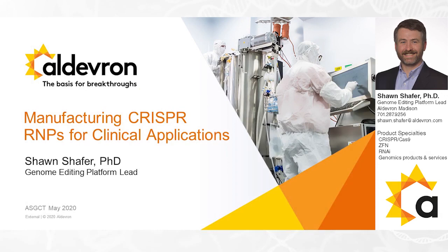I'm going to be speaking to you today about the work that we've done at Aldevron to manufacture CRISPR RNPs for clinical applications. When I joined Aldevron, they were already offering GMP-Cas9 for CRISPR therapies. And in the last 2 years, we recognized that there was a great need for having a comparable product around RNPs. And so I'm going to talk today about some of the work that we've done to establish that.